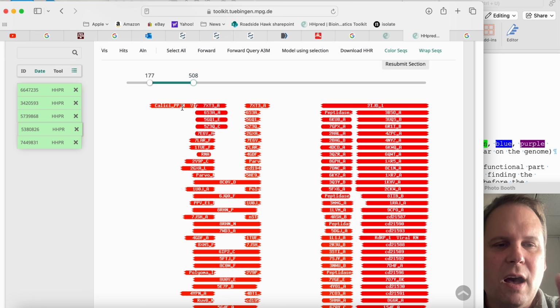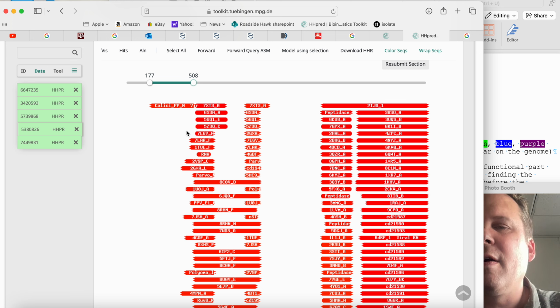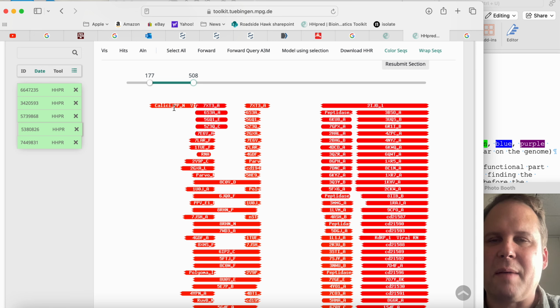What we're looking for are columns, and you want to see how many columns of things you have. So I've got 1, 2, 3, 4, and 5. It's only one thing in that column, but we'll call it a column anyway, because it's occupying a different space here on our little line at the top. So I've got 5 things that I can probably annotate.